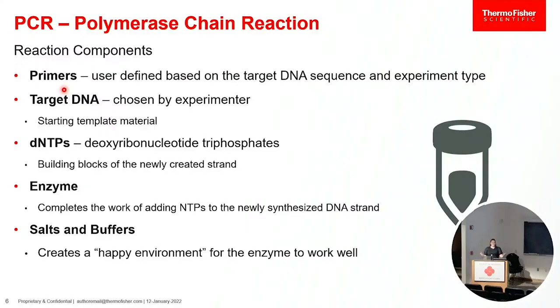It's of your choice. I go out into the parking lot or the bathroom and I collect swabs off of everything and see how dirty it is. That's sample. It can also be material from a cell line. It can be so many things. There is DNA everywhere. And you'll understand that when you start working with these amplification reactions. There's DNA everywhere in life. So those 2 points are specific to each and every experiment, and you get to pick that.